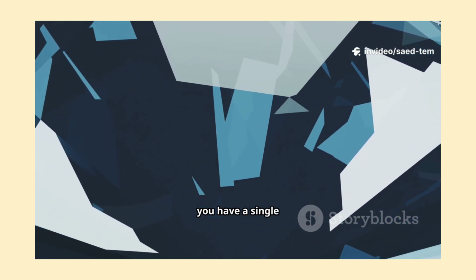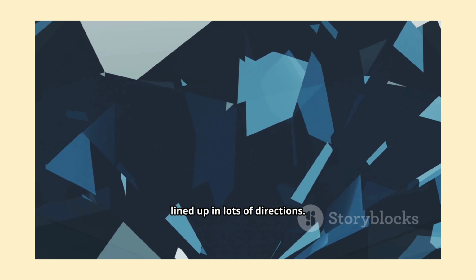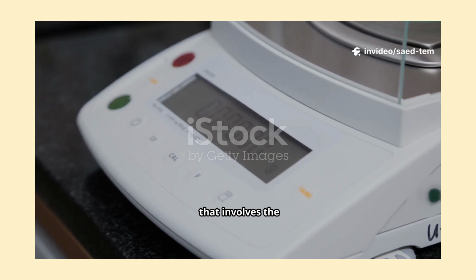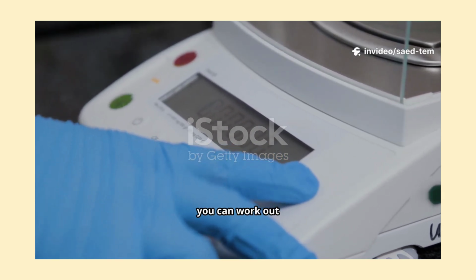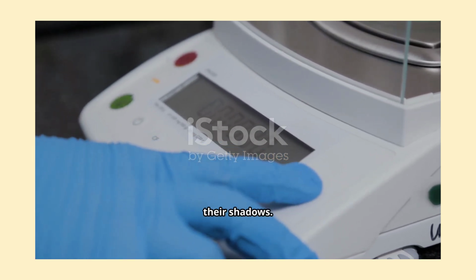If you see spots, you have a single crystal, with very orderly atoms. If you see rings, you have many tiny crystals with atoms lined up in lots of directions. By measuring how far these spots or rings are from the center, and using a standard formula that involves the electron wavelength and the camera setting of your microscope, you can work out the distances between atomic layers, just like finding the spacing between bars in a fence by looking at their shadows.